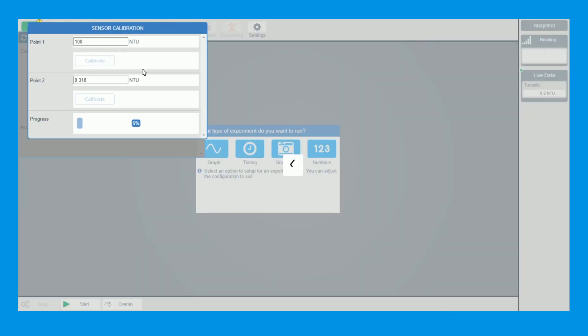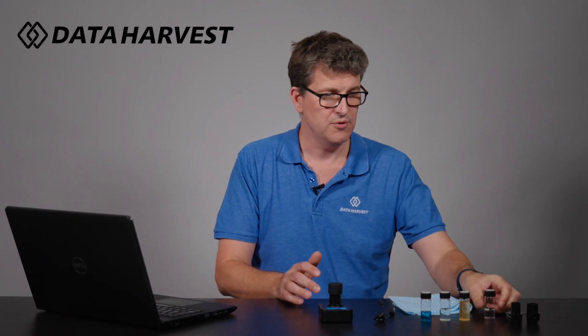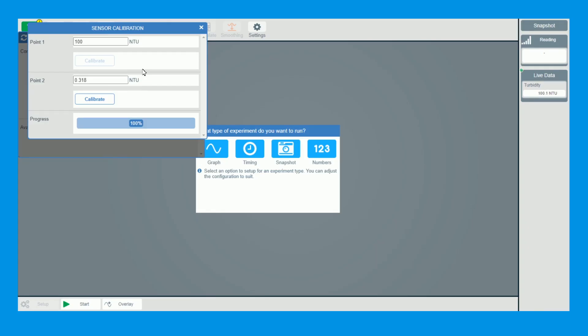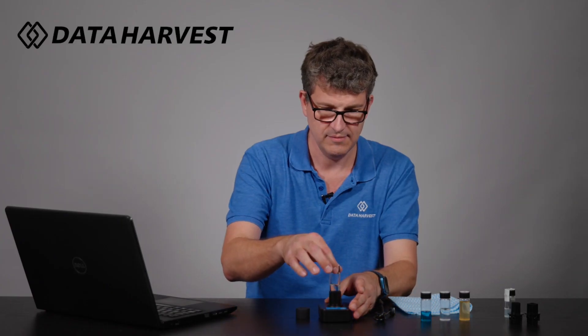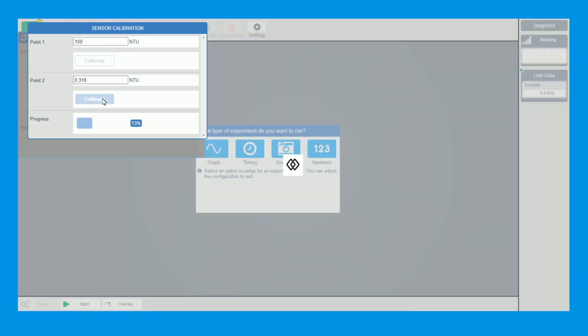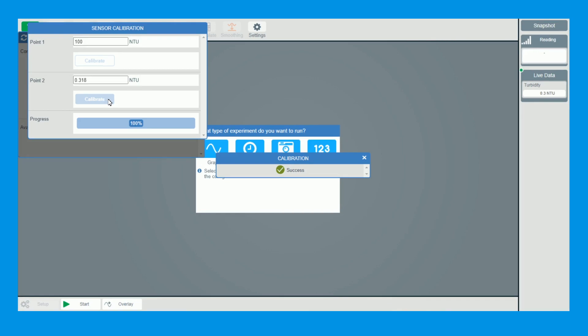I now go and click Calibrate. You can see down the bottom it's showing a percentage progress — it doesn't take very long. Once that's done we also have a 0.3 NTU sample, which is double distilled H2O. Our worksheets show you how to mix that up — you've probably already got it in your science lab, but there are instructions in the worksheet just in case. Once that one's done — there we go — we pop that in, put the lid on, and we're now doing the 0.3, which is actually 0.318 to be precise. That's what your double distilled water should read. So we're now calibrated.